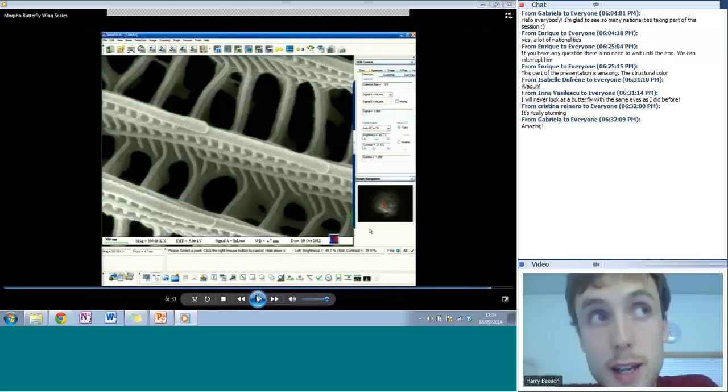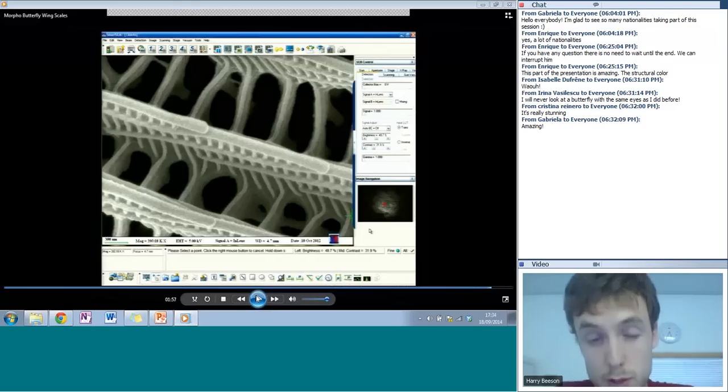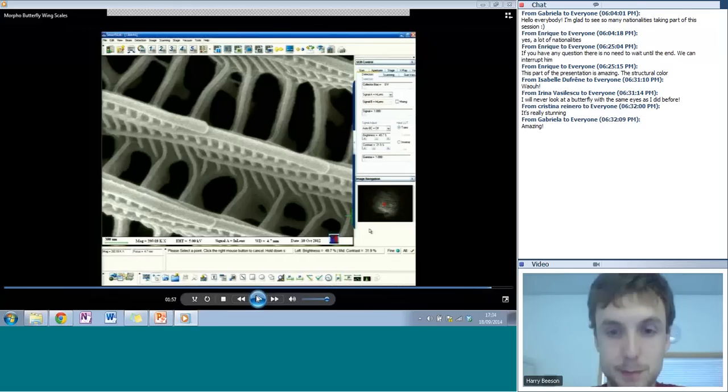Yeah, so we have one of these microscopes at the Nanoscience Centre. Across the university in total, I would guess there's probably something like 10 to 20. So yeah, you need to book, but we take it in turns to use it. But with this one, fortunately, it doesn't take too long to set up and use. So within a half hour or an hour even, you can get reasonable images. Okay, thank you. You can continue. Cool.